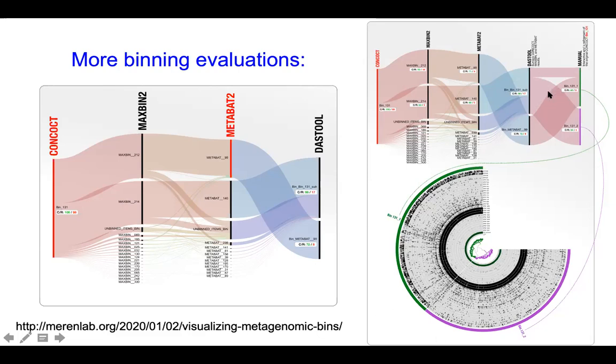We see that relative to DASTool, when we look at the Anvi'o plot at the bottom, in some of the samples the outer ring is relatively dark colored, here in green and not so much in purple. So we see that by looking at it manually, even though the three samples that drive both of these bins, the abundance indicated by lots of dark coloring here is similar.